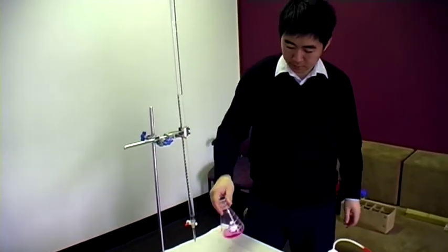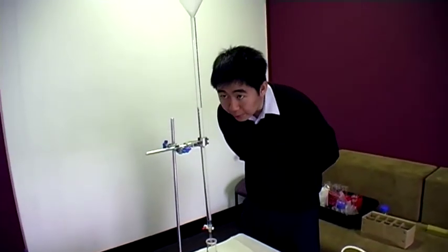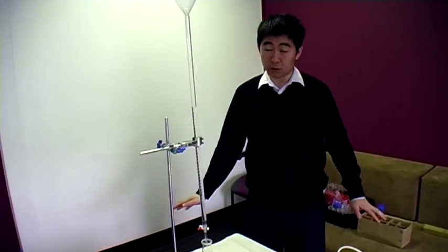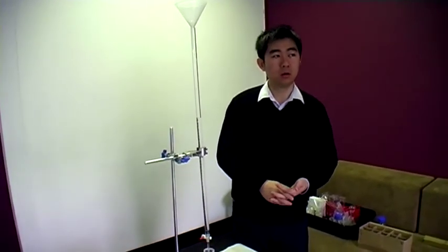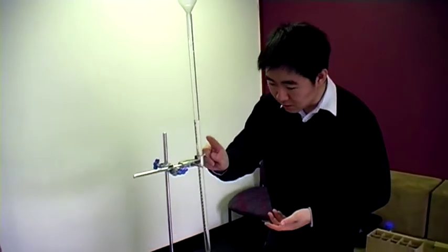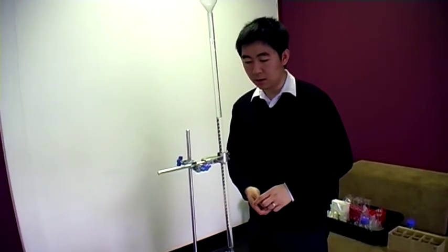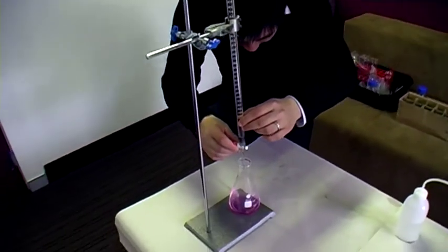Here's our third titer. We've refilled the burette and we're starting at 18.6. We're expecting around 23 mLs, so 18.6 plus 23.1 would be 41.7. We're expecting the burette to run down to around 41.7. Let's let it run down to about 40 and then start paying very close attention.